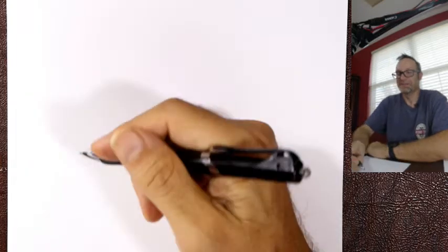Okay, so it's lab number 2, which is density. Before I get into the nuts and bolts of the experiment itself, let's just remind ourselves real quick how you get to the experiment. So here's a little checklist.